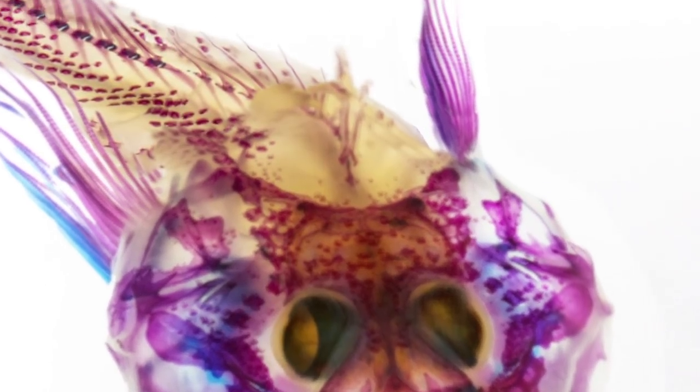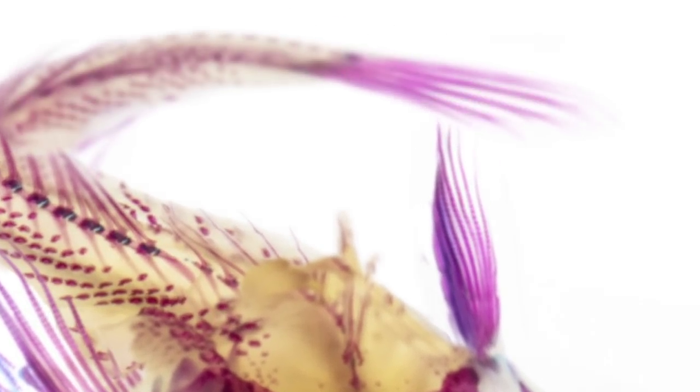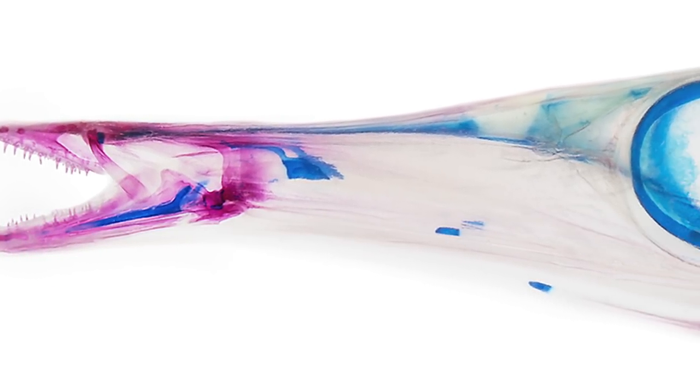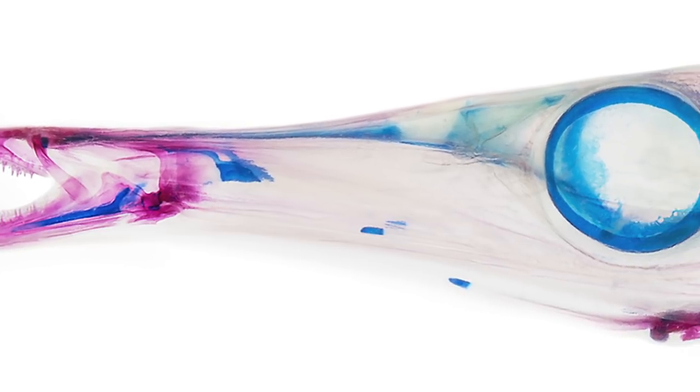Any time I look at the fine detail of skeletons, I become inspired. This gorgeous red and blue skeleton.